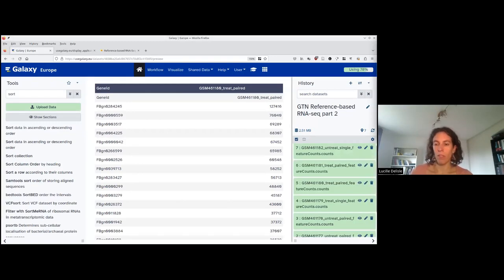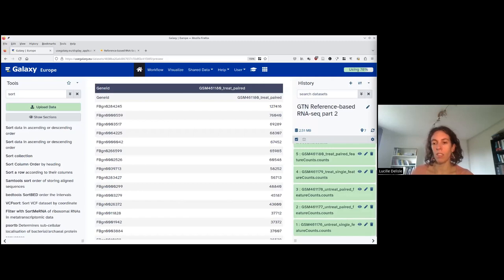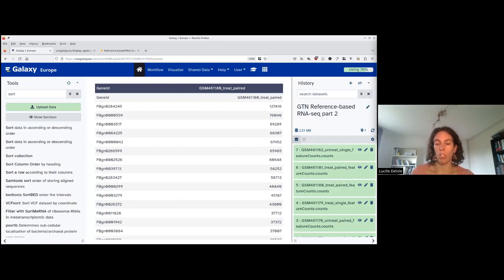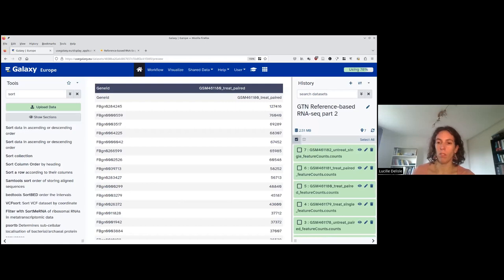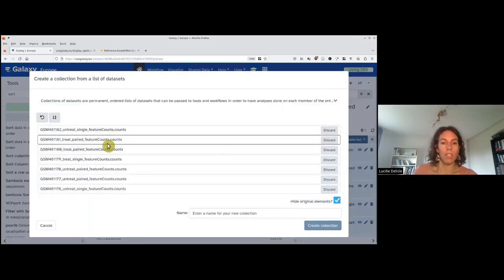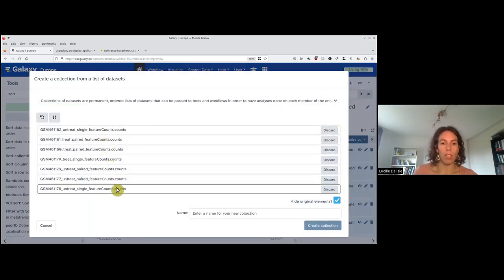The upload has finished. Again, we will compact all these datasets into a collection. But this time, we don't have a paired-end collection, but just a collection that we call a list. I click on the checkbox on the top left of the datasets, then click 'select all.' For all seven selected, I build a dataset list. Here I can see my seven samples, and for each of them I have the featureCounts counts.